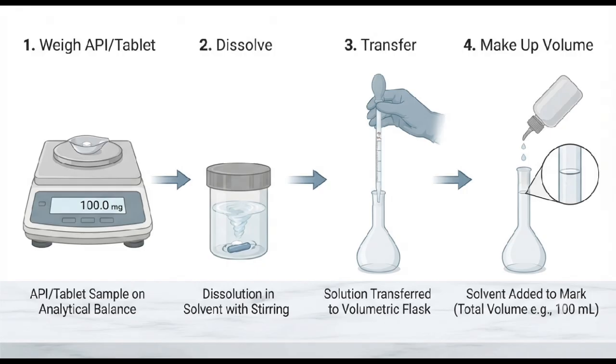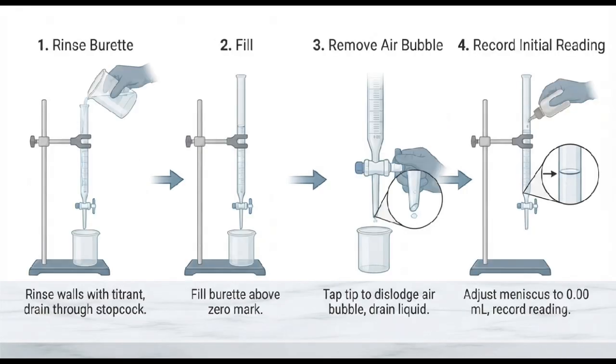Filling the burette. Before titration, the burette should be properly rinsed and then conditioned with the titrant. Fill the burette above the zero mark, remove any air bubble from the tip and record the initial burette reading carefully.